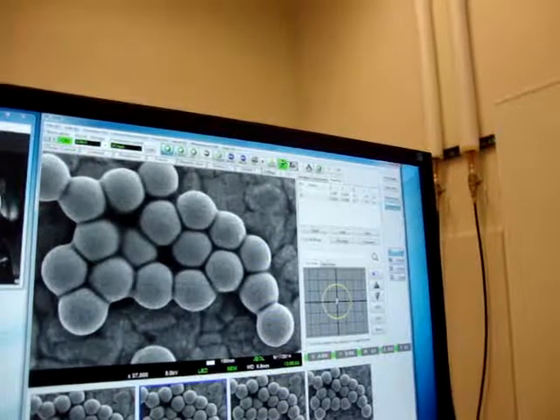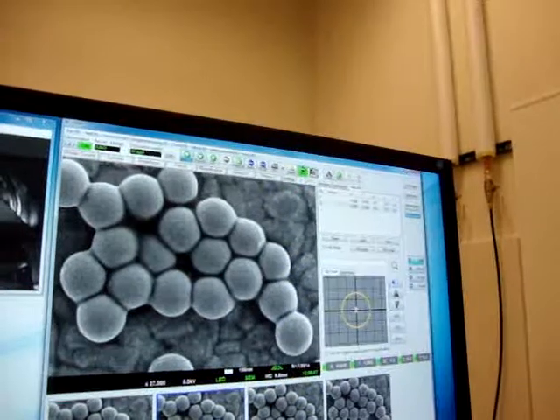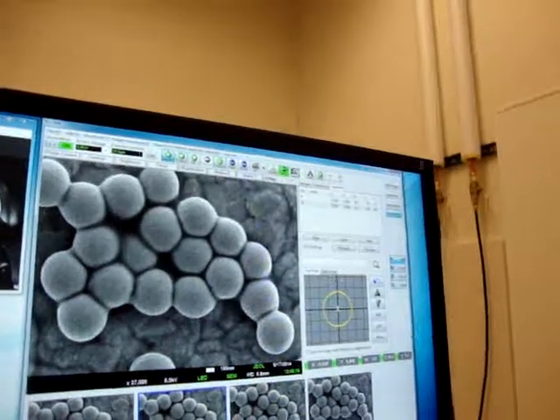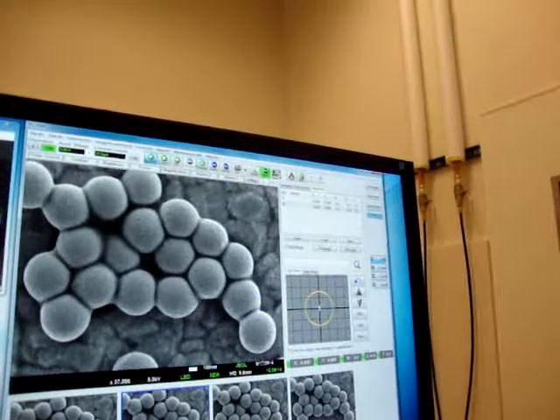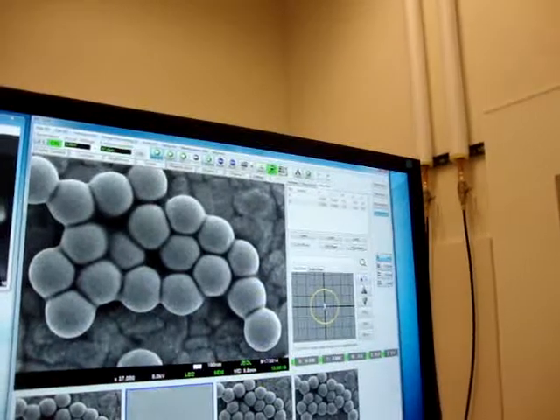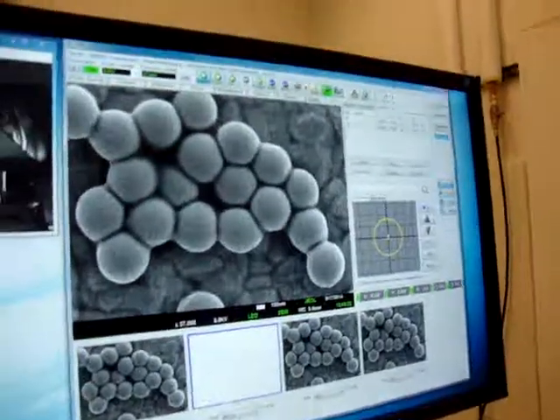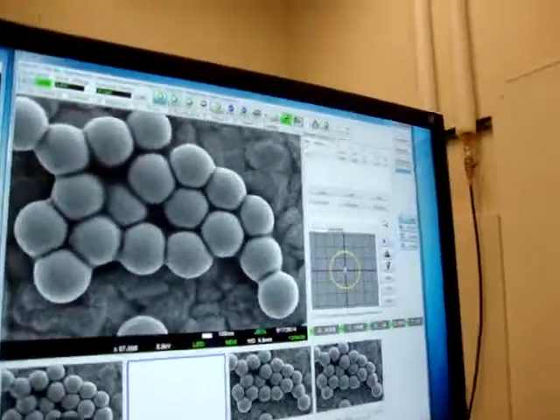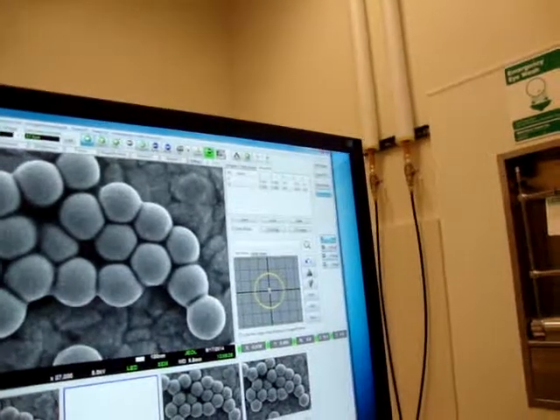But then, if it's processed by the other one, why couldn't I see the image? Because they took it away. They put it in the center. What do you mean put it in the center? He's saying he moved it from here to here. So that you know which one. And then if you want it, you go, oh, I'll take a picture of that. So now that picture was there, now it's up there, I think is what it says. Okay. I understood the same.